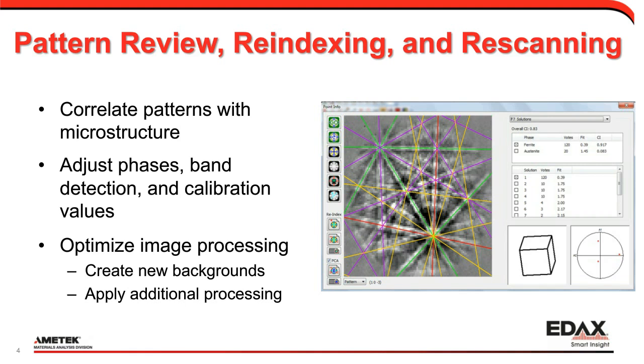But for somebody like me who's getting customer samples and data sets from all over the world, it can be really useful. But really, what I can do with this is also optimize the image processing, and this is what I'm focusing on today. I'm going to create new backgrounds and also apply additional processing.